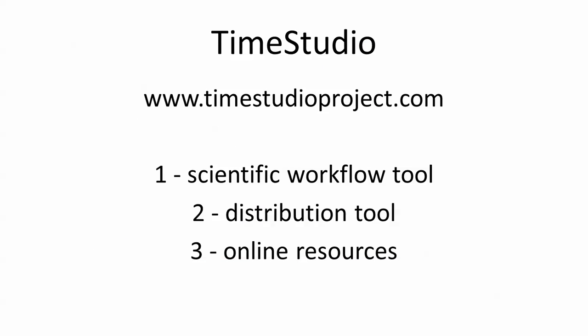And third, the TimeStudio project includes online resources to help spread new successful paradigms and valid scientific findings. You can also find video tutorials and help sections to get you productive at the moment. So to illustrate how fast you can get working, I will install TimeStudio with MATLAB and download a workflow.